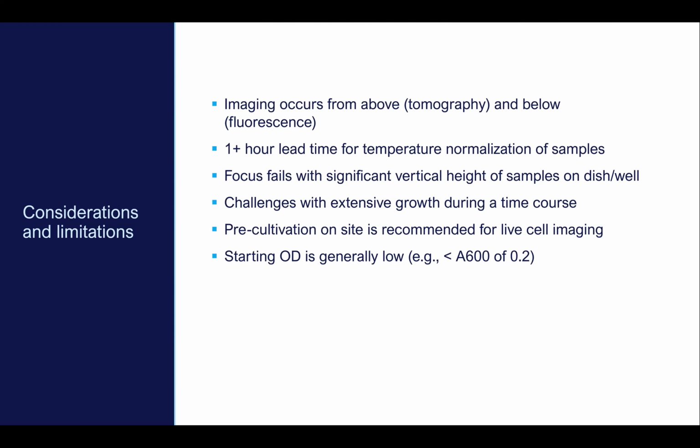So focus does fail, and sometimes calibration of the instrument will fail with significant vertical height of the samples on the dish or the well. So that is a challenge if your samples have a particular shape to them, but it is navigable. So, there's some possibility for getting around that.